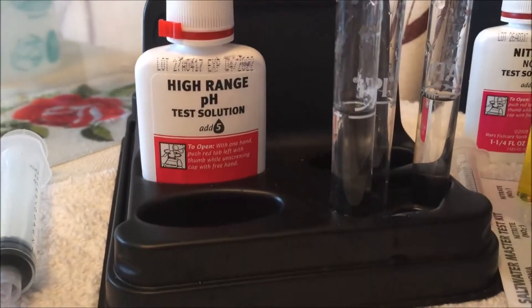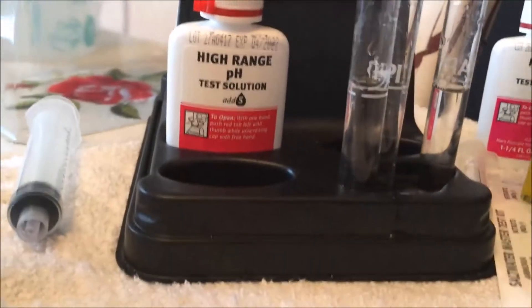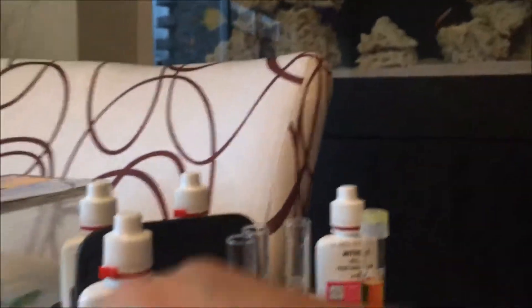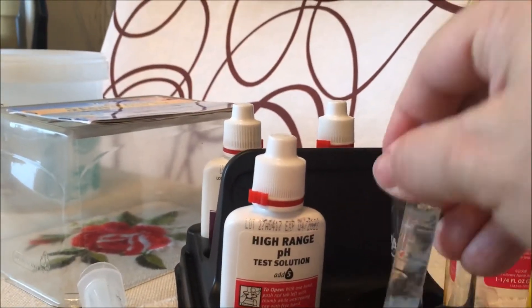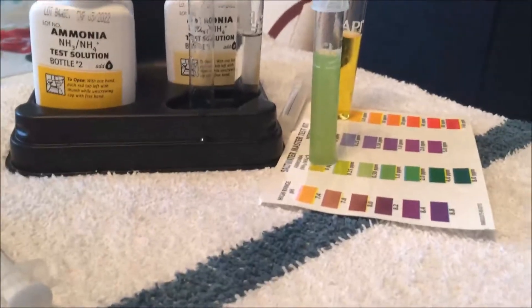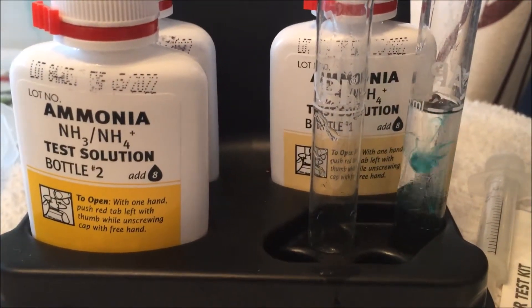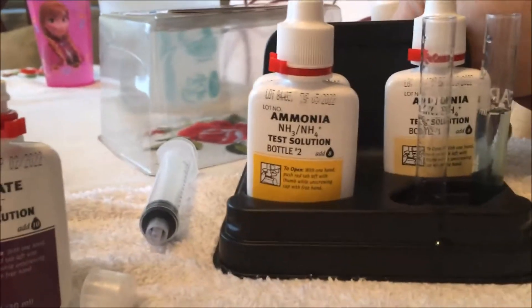Next we're going to do the ammonia test - eight drops, then two drops of number two. Let's shake this guy up. Then we're going to do the nitrite test, so we're going to put in five drops. All right, we got five drops - let's cap it and stir it.